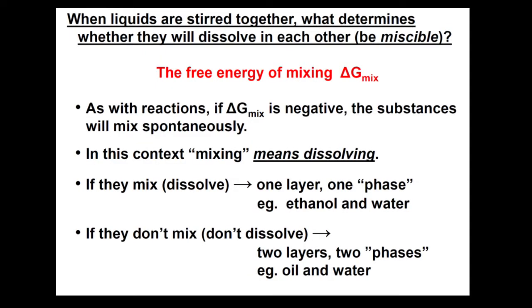This lab is actually about the mutual solubility or lack of solubility of the three liquids: water, 1-butanol, and acetic acid. And as you probably already know, water and butanol do not mutually dissolve. We say they don't mix. When you mix them up, they will separate into two layers. But water and acetic acid, as you know, do mix. In other words, they mutually dissolve.